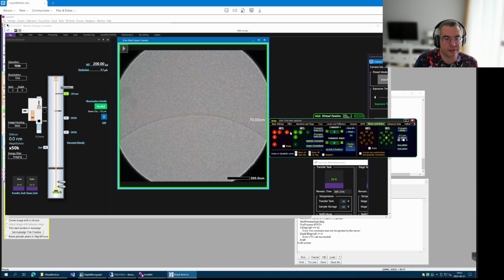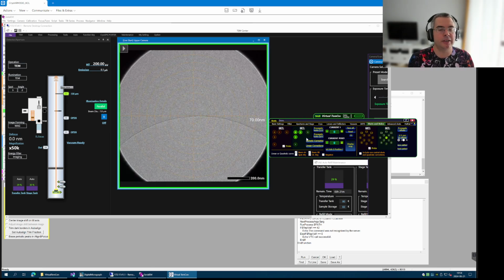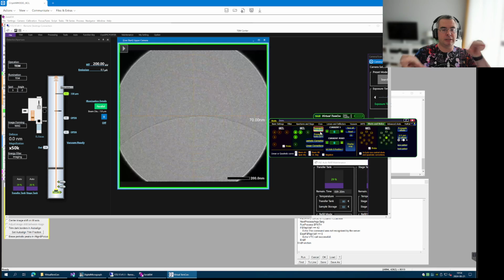And it has been captured. Then we set hole 0, and then we propagate holes 1 to 3 again. This time, this propagate is being done at the correct magnification and using holes that have coma and OL stig fixed. So it's possible to extrapolate the change of coma or the change of OL stig as a function of image shift distance. The initial propagation at lower mag was just to get to the correct positions, and probably you could skip it if you knew the vectors.